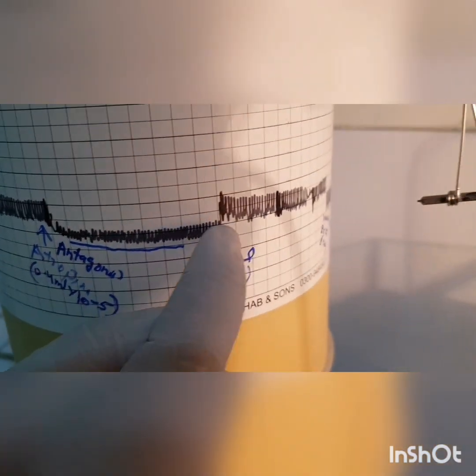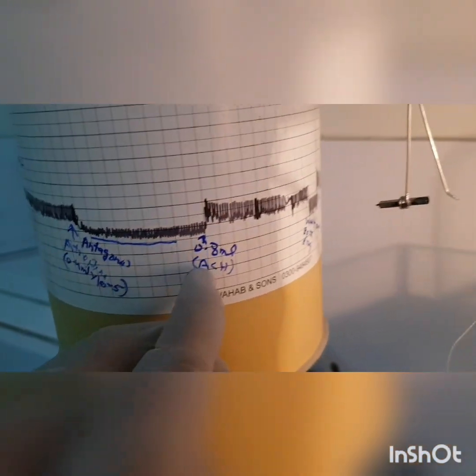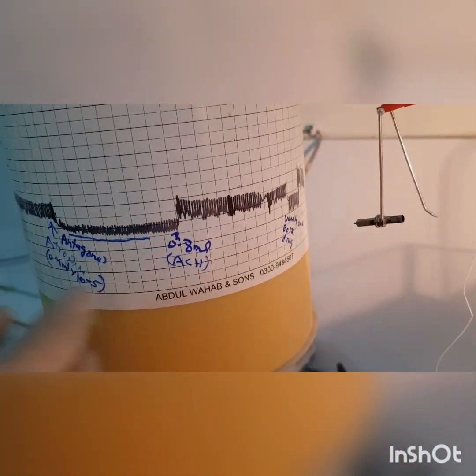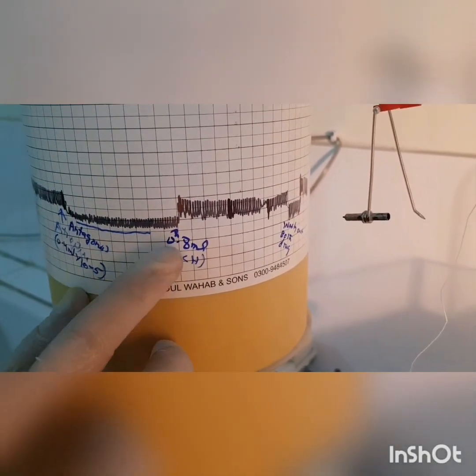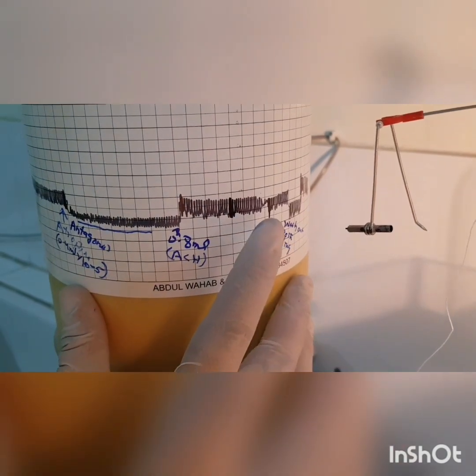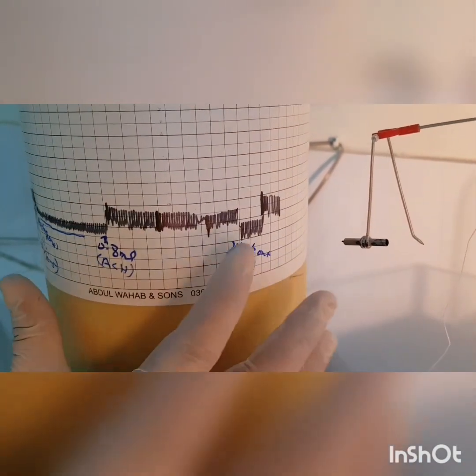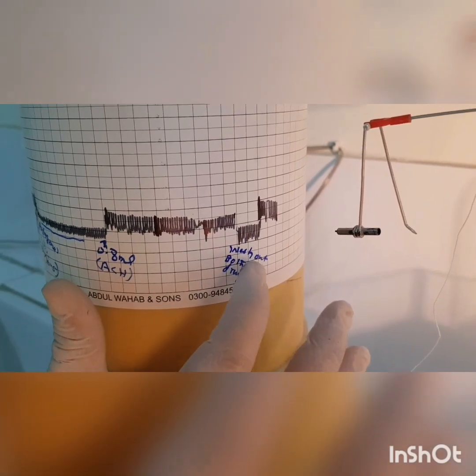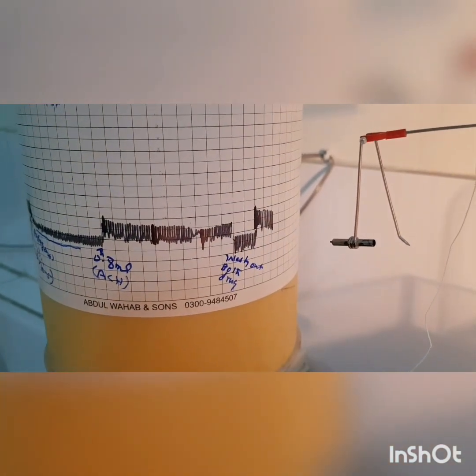It shows less contraction in the presence of the antagonist. The dose here is large, 0.8 ml, but the receptor is partially blocked. Then we wash out both the drugs. Again there is normal contraction.